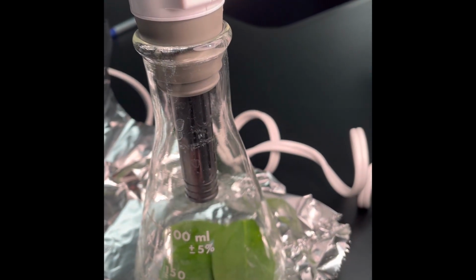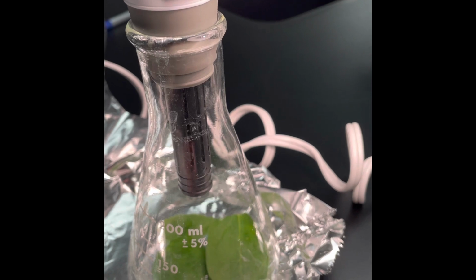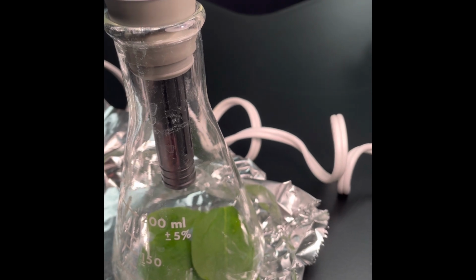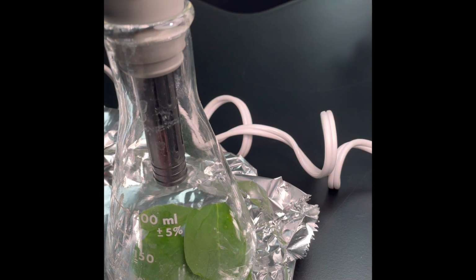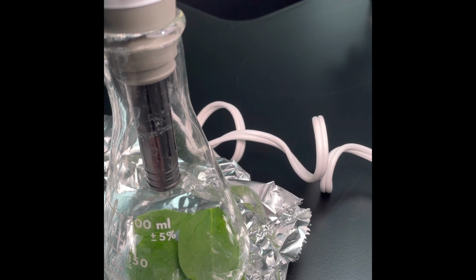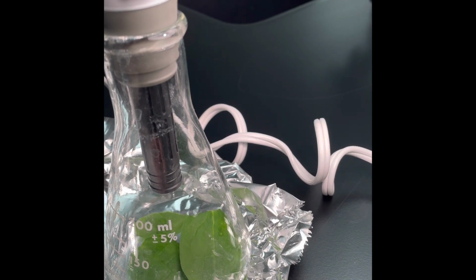Got the bright light. This is actually a grow light. So this filters out some of the wavelengths that are not very good for photosynthesis, and it kicks up the ones that are. So we're in the blue-violet range along with red, and we've got fewer in the green and in the yellow. So it's filtering out the green and the yellow.